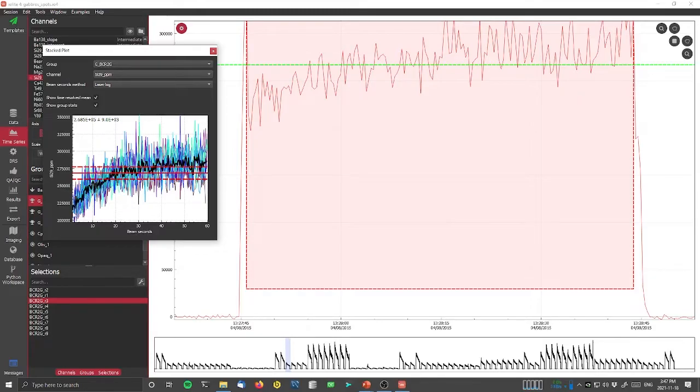And what we can see is that when we average out that noisy individual measurement data, there is a trend in our downhole. There is a trend with increasing depth or increasing beam seconds. One of the things we can use to estimate that is that at the moment we have an uncertainty of about 9,000 about this mean value.